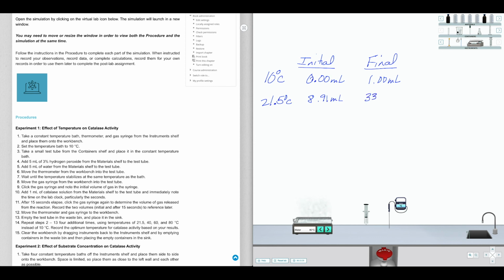At 40 degrees Celsius, your initial reading was 12.79 milliliters, and your final was 33. Let's see. Oh, you know what? I think I gave you the wrong final reading for our 21.5 degrees.